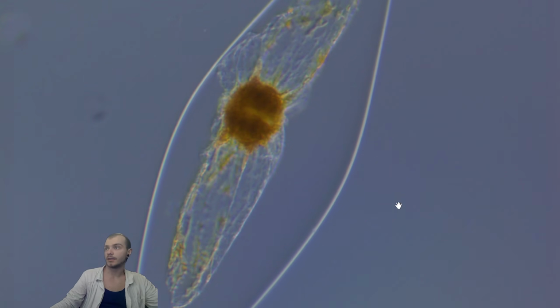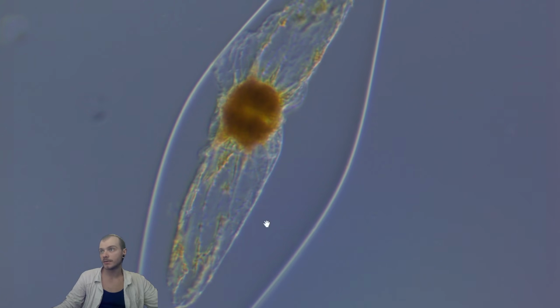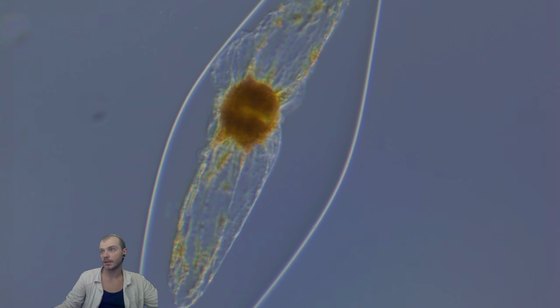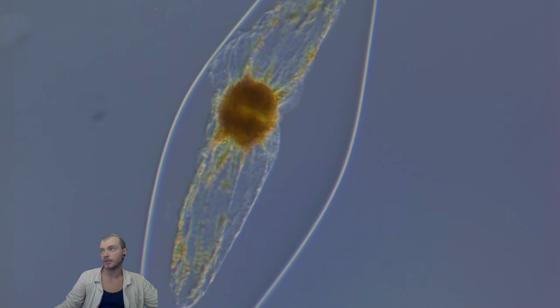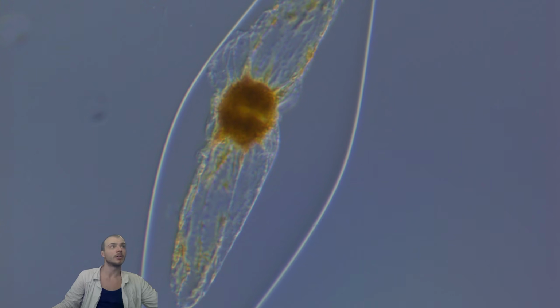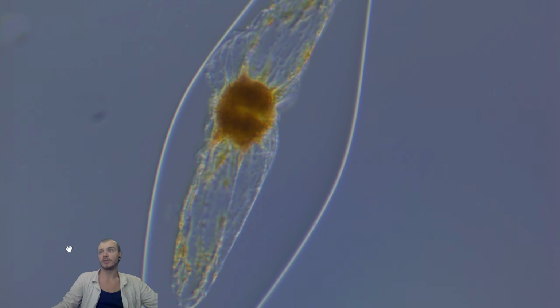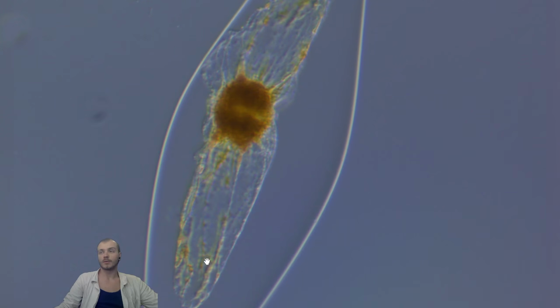And here is the nucleus, and here are the chloroplasts, which are taken to the nucleus when it is going to nighttime, so it will have more space for the enzymes which will glow by the reaction.